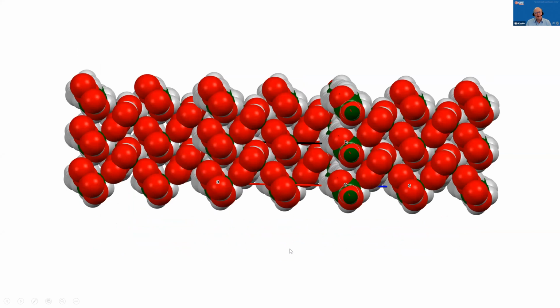And ultimately what happens if you look down the chains, you see they twist. I'll wave my hands. They twist slightly, and not all the torsion angles in the chains are 180. There's some subtle variation. So it's kind of a fun systematic series, but it was fairly challenging because none of the normal approaches would work. We had to base this on what we knew had to be the case from smaller molecules.